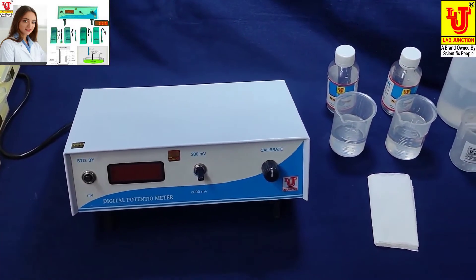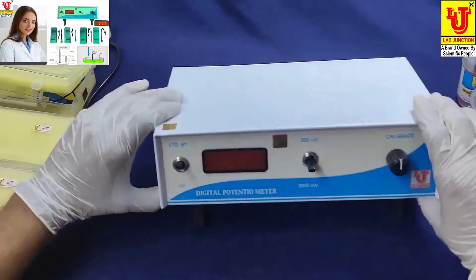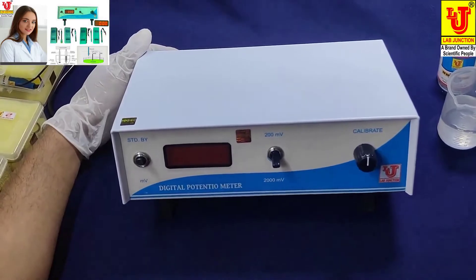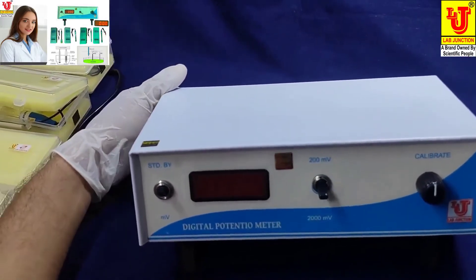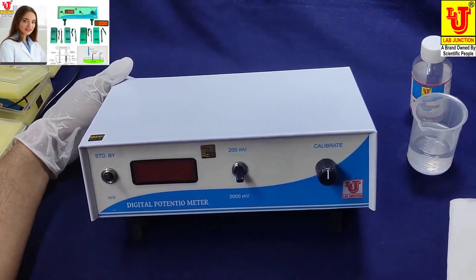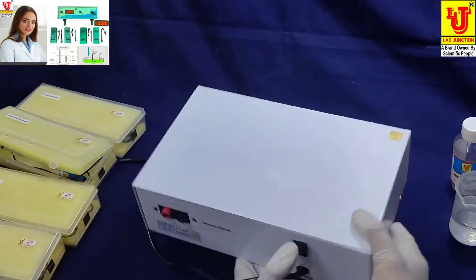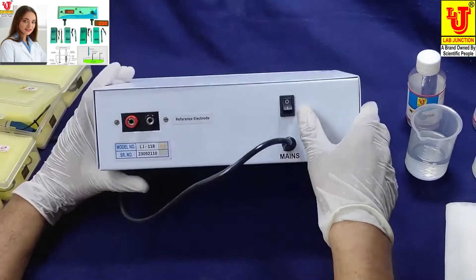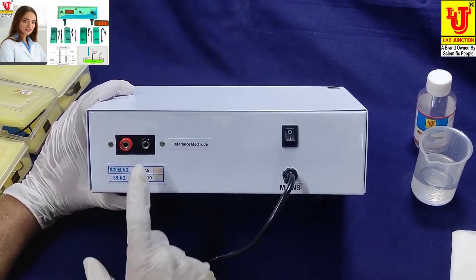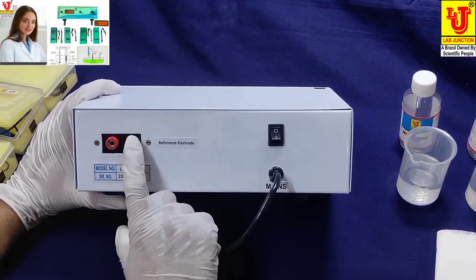Now, how to use and install this instrument. This is our main instrument — front view, side views, and back view. In the back view, this is the on/off control. And these are the two nano sockets for inputs.